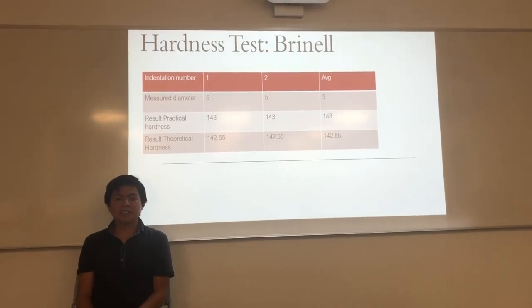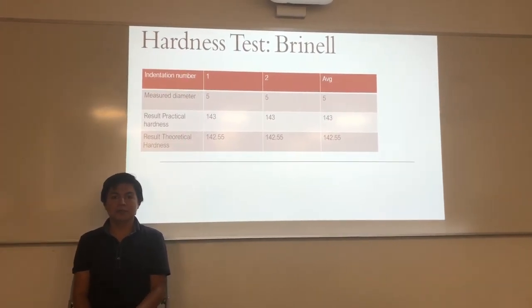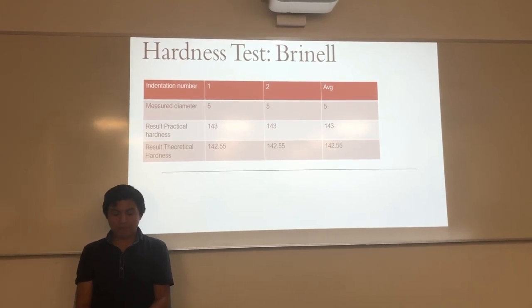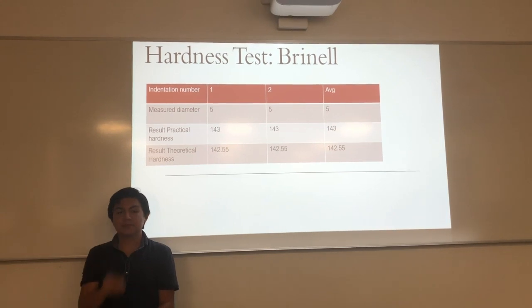Well, for the hardness test, there were another 4 tests, one of each type of hardness. The first is Brinell. It is important to mention that for the 4th test, I used only this piece.